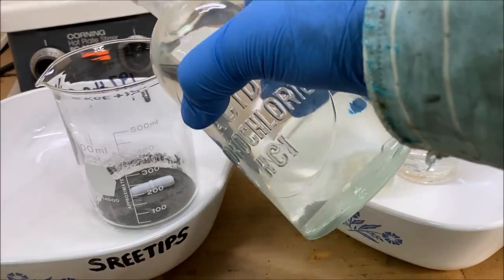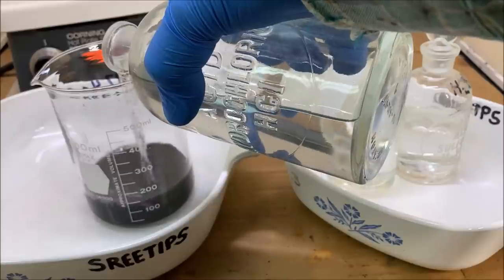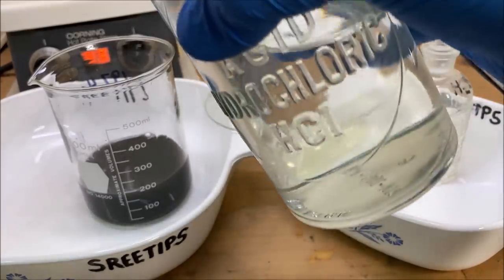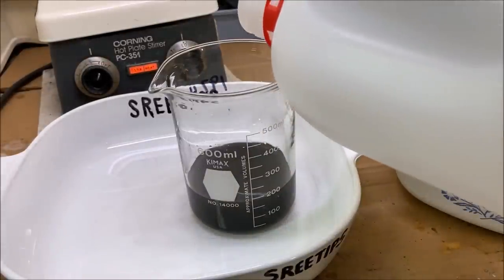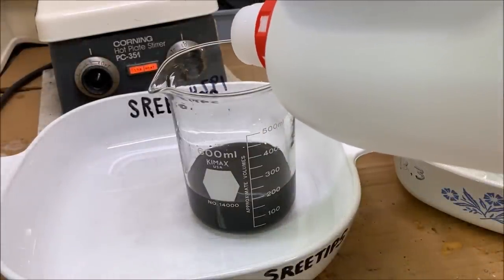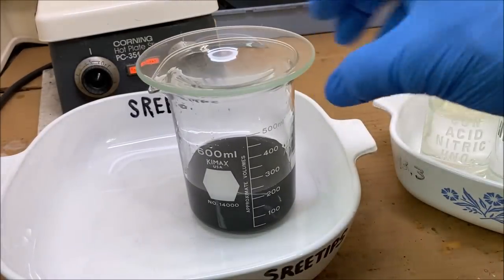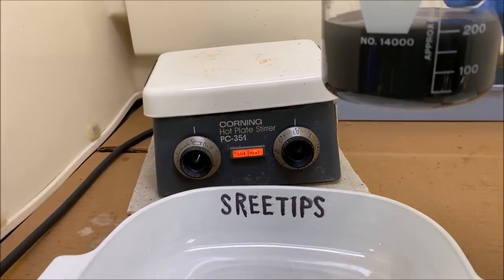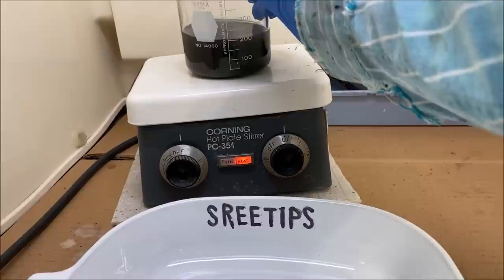I'll add a stir bar to the impure sponge. Here I'm adding about 200 milliliters of hydrochloric acid, and then we're going to add about 25-30 milliliters of nitric acid to form aqua regia, and we're going to dissolve this impure platinum sponge one more time here, cover it up, set it up on the hot plate stirrer there, and start dissolving our impure platinum sponge.